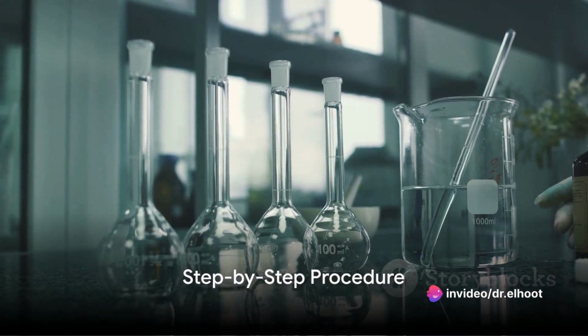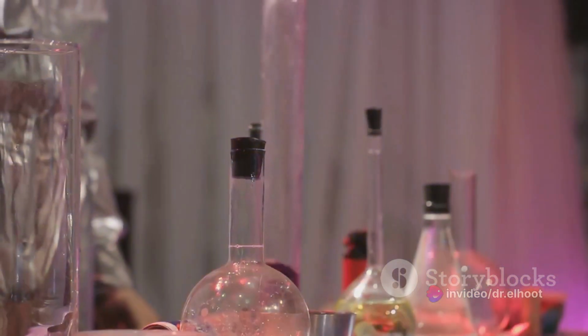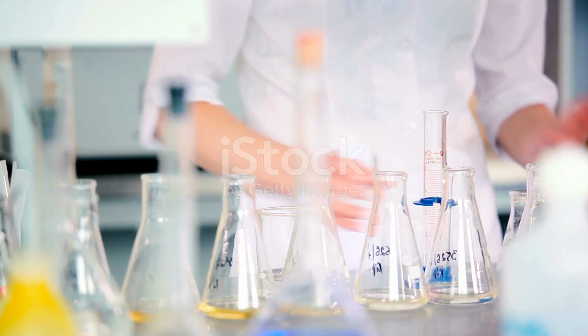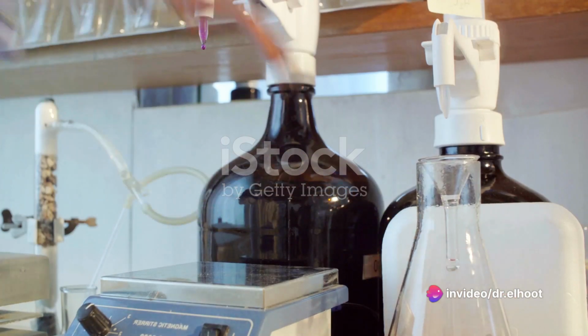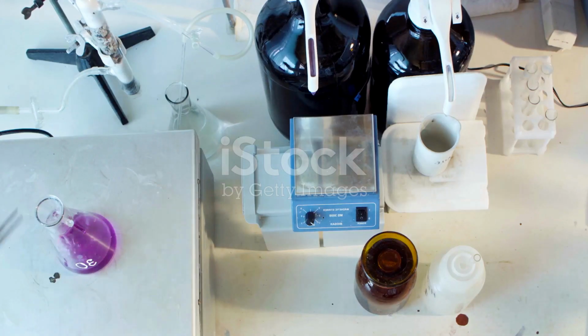Then stay tuned. Now, imagine this. You have a diluted sample solution of Zinc Care® eye drops. Your goal is to determine the concentration of zinc ions in it. You start by transferring 10 milliliters of the sample into a clean conical flask. Then you add 2 milliliters of ammonia buffer to stabilize the pH at 10. Next, sprinkle in a few specks of EBT indicator. This gives the solution a dark wine red color as the EBT forms a complex with the zinc ions.